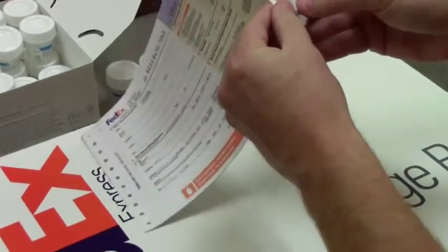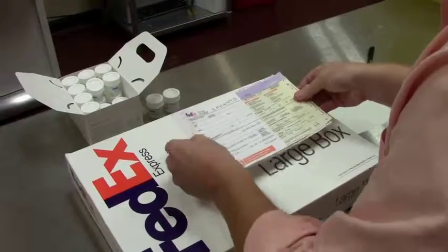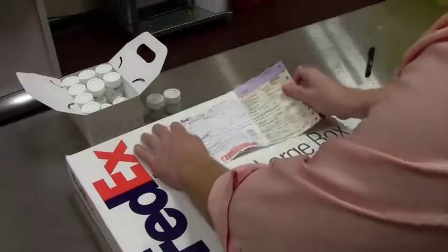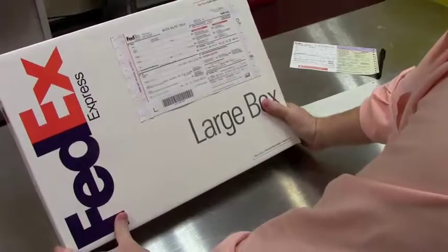And the labels are self-adhesive. You just pull the tab off, stick it on the box, and this will be your copy. So you'll have it. Keep that for your records, and then call FedEx, and then they'll come and pick it up.